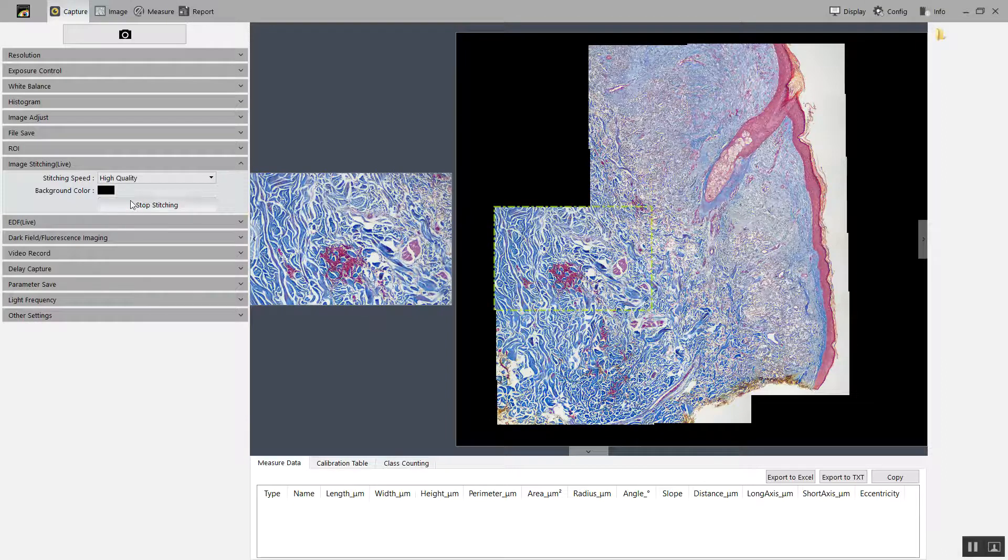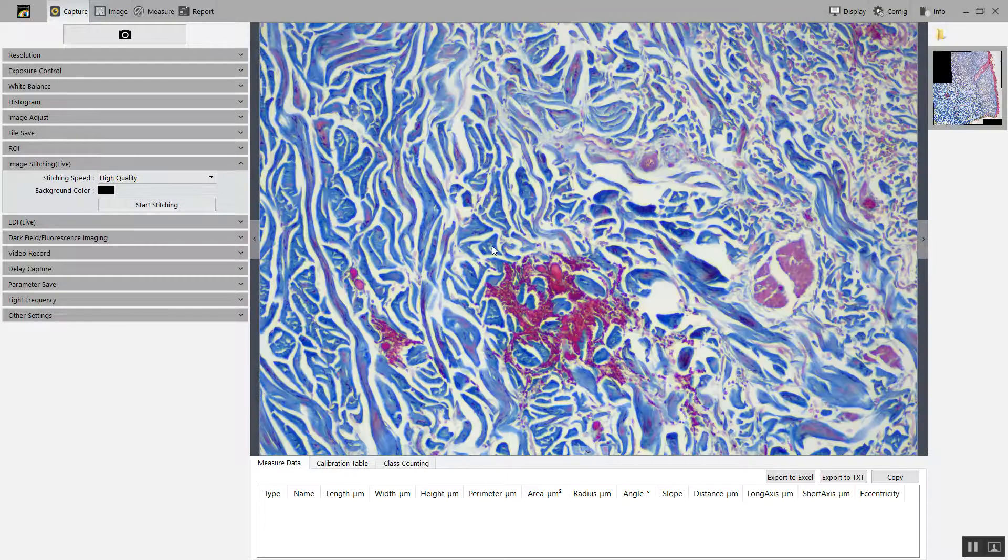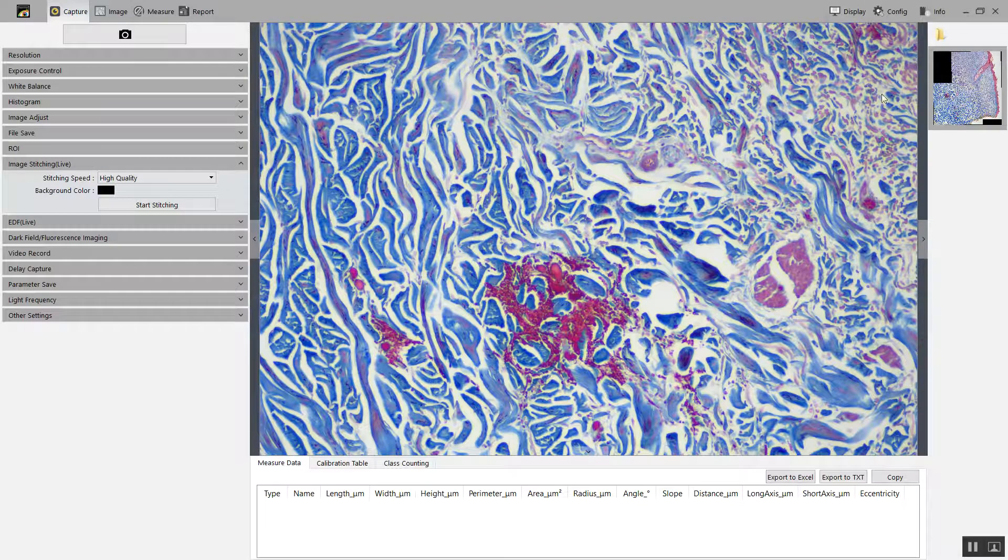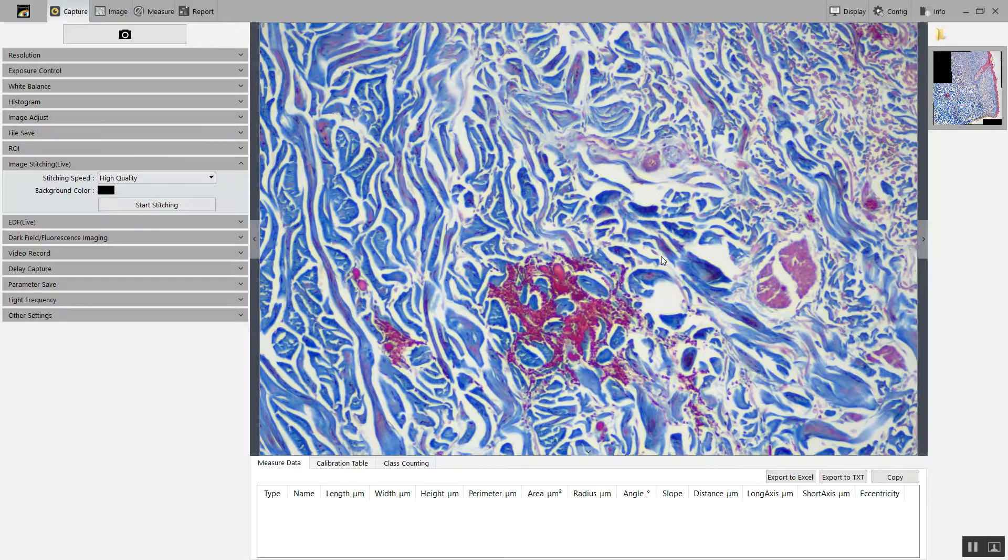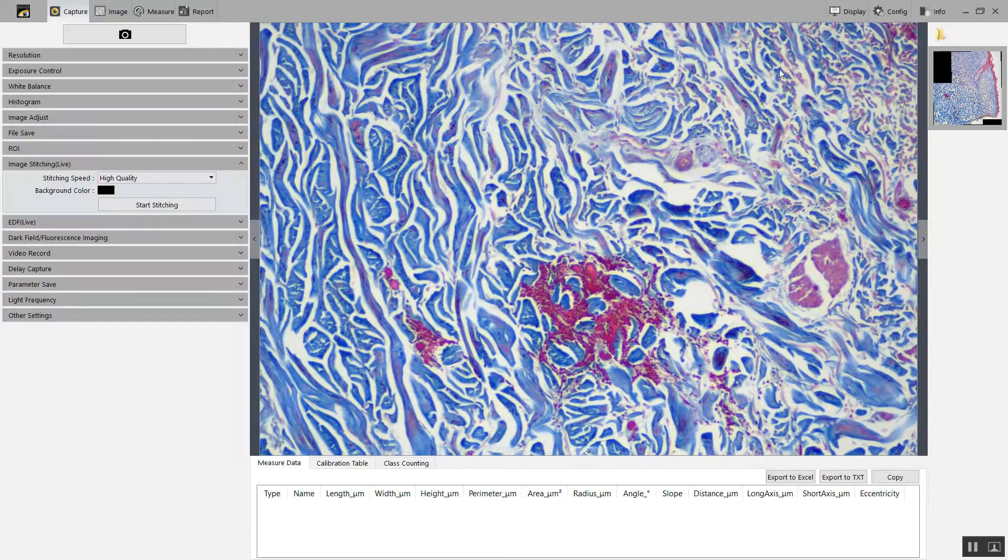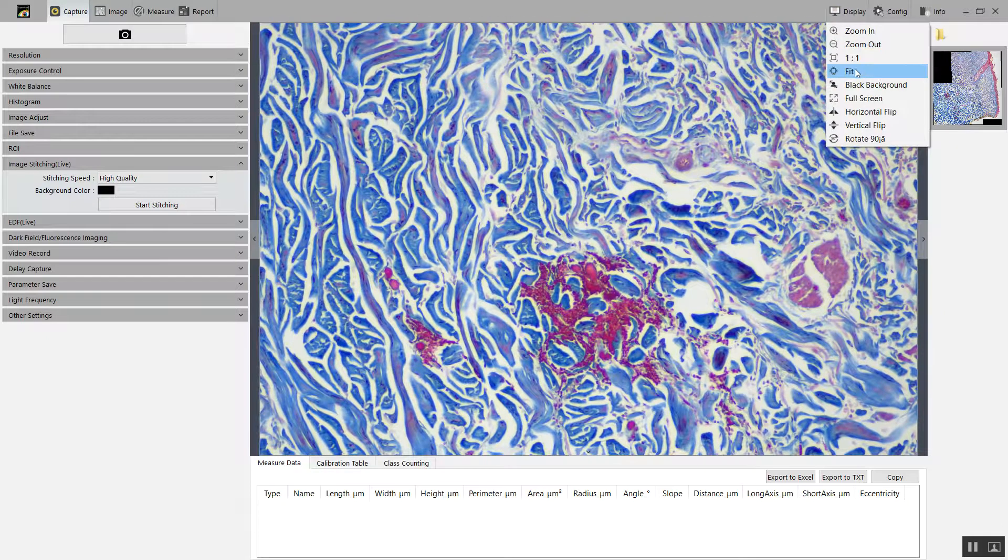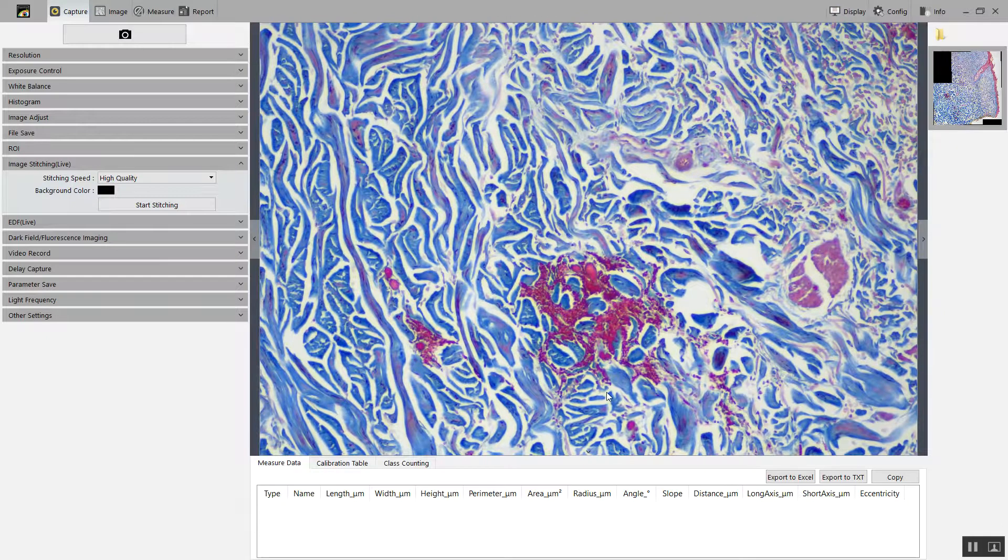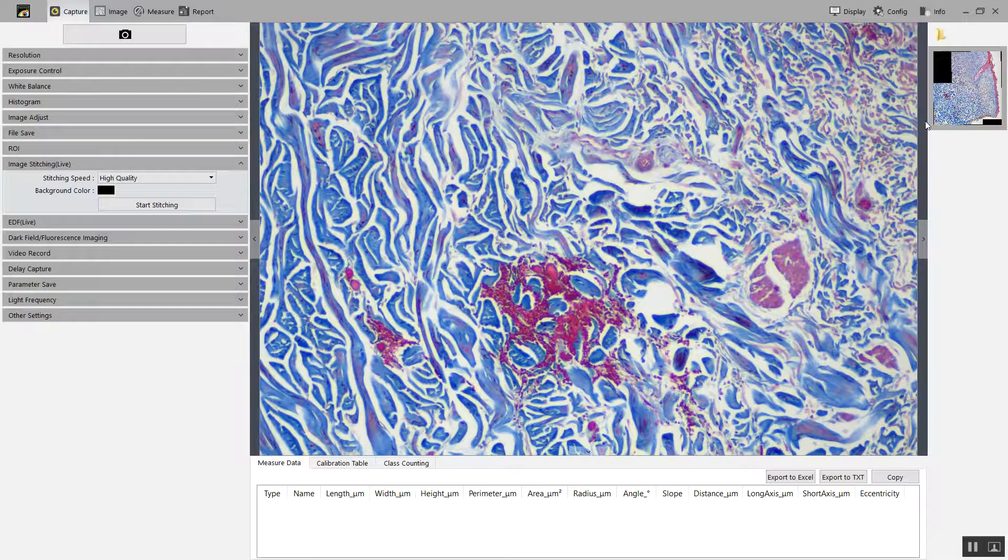I'm going to stop my stitching, and it will save the image here to the right. This is the live image. This is the saved image.